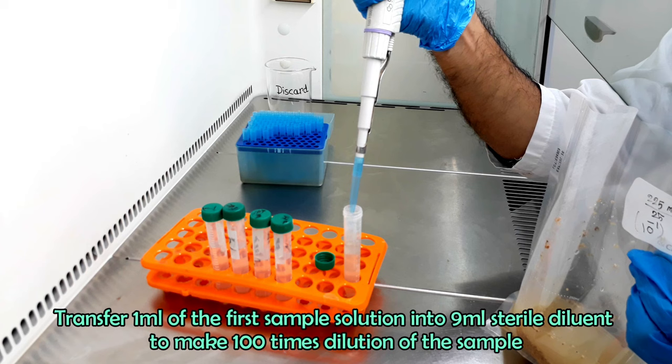Label another plate as media control. Pour 20 ml plate count agar media into the media control plate, which is done for contamination check of that prepared media. Label another plate as diluent control.